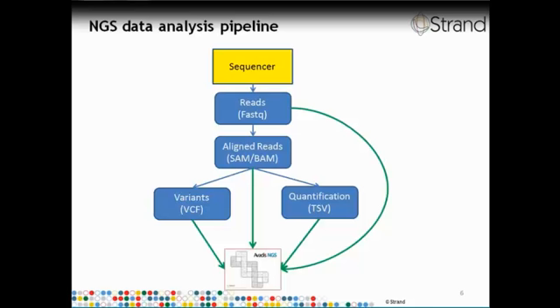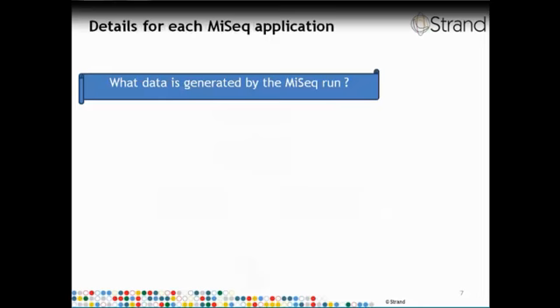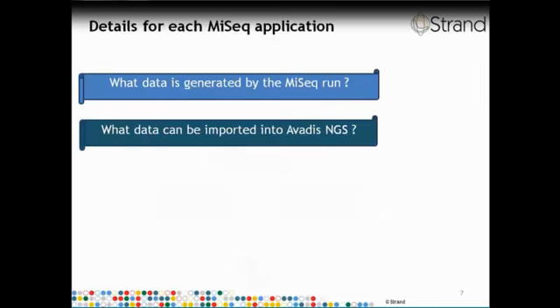The output of a MiSeq run is a folder. In this particular case, the folder name is 110509 bold, etc. All of the data sets that I'll be showing in today's presentation were made available by the MiSeq product team in August of 2011. They're used here only for demonstrative purposes, and if you have a MiSeq instrument which came out after the date, the results might be different.